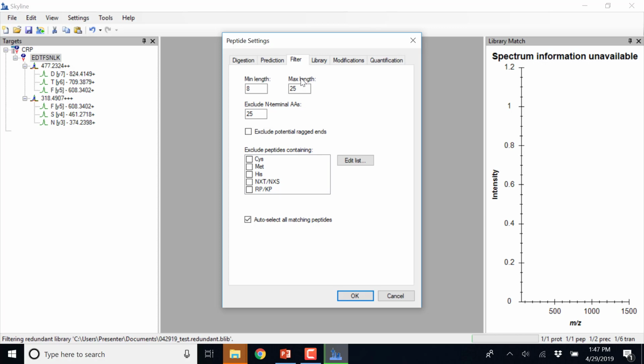This is because many people that work from proteins in like cell lysates or plasma or whatever, there are a lot of exoproteases in samples that will just go nom, nom, nom, nom on your protein from the ends in. And so oftentimes you won't have the N-terminus that was expressed originally with your protein. So we usually exclude that because it's highly variable.